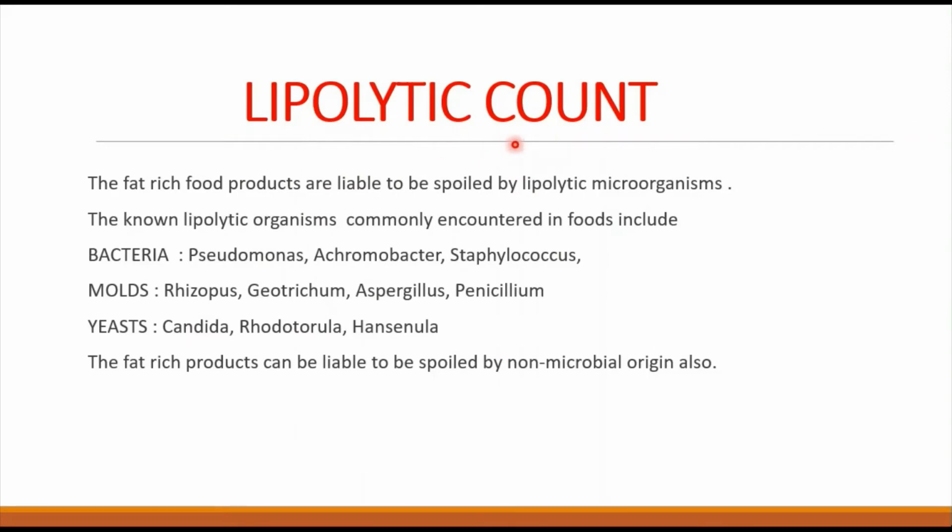The lipolytic count. The fat-rich food products are liable to be spoiled by lipolytic microorganisms. The lipolytic organisms commonly encountered in foods include bacteria such as Pseudomonas, Achromobacter, and Staphylococcus. Then the molds are Rhizopus, Geotrichum, Aspergillus, and Penicillium.